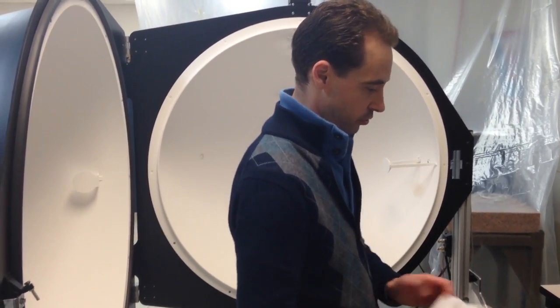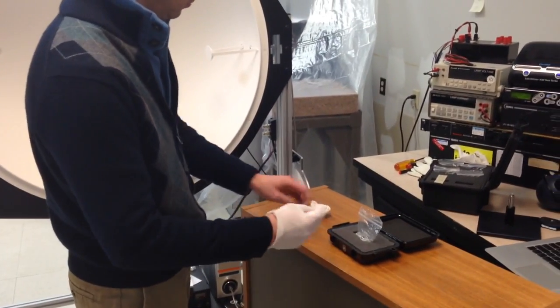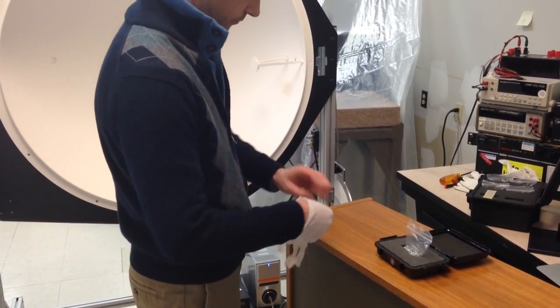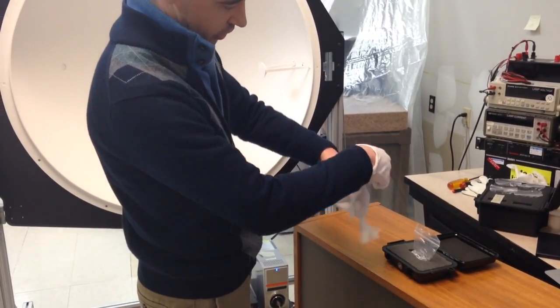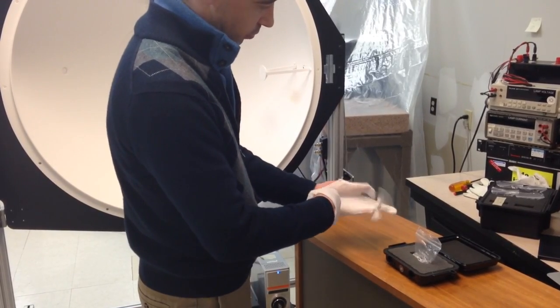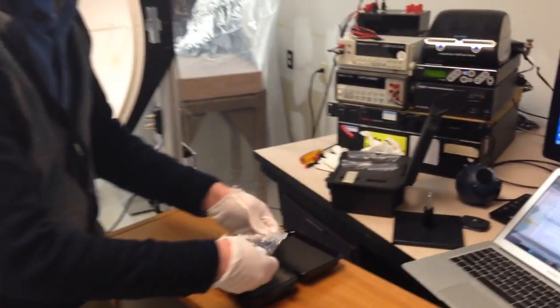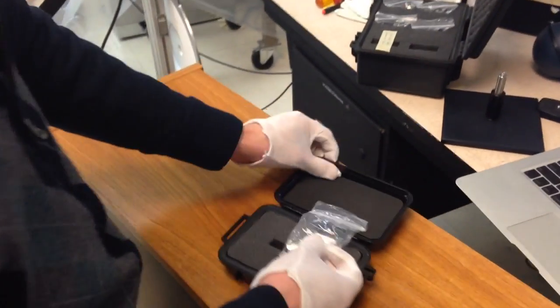So the first thing that we want to do is we want to put on our gloves. And these are very expensive calibration lamps, and they can also be sensitive to oils on the skin. So we want to be careful when we handle these and store them in their containers.